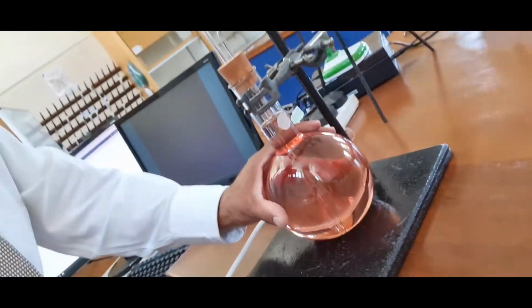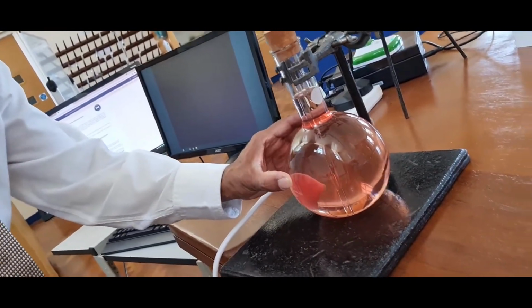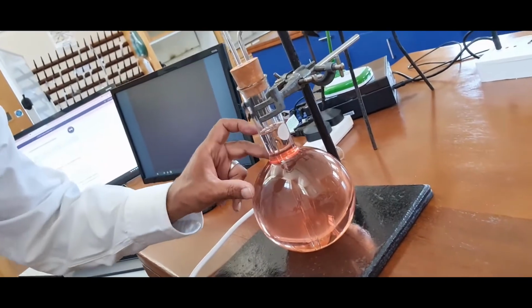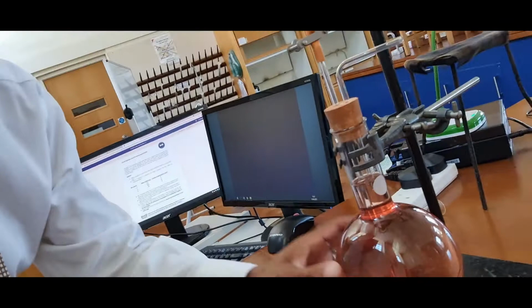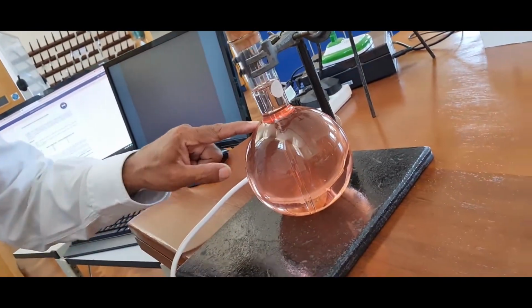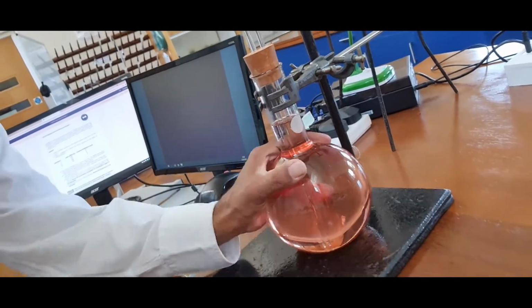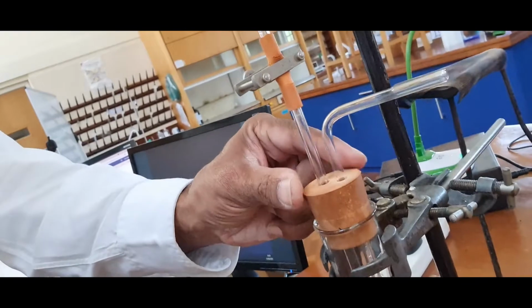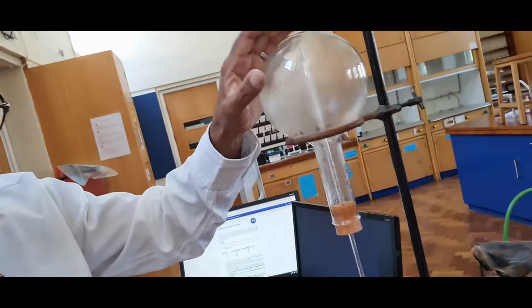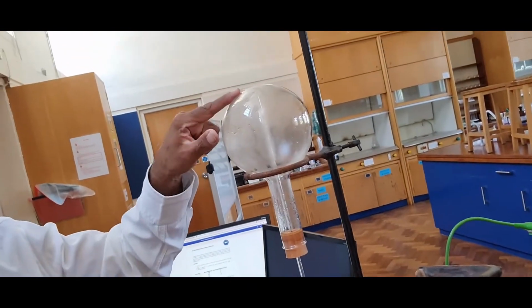This is water with a drop of sulfuric acid and a few drops of, no, actually, not phenolphthalein indicator, universal indicator. Universal indicator with a drop of sulfuric acid makes that bottom flask red. The bottom flask is attached to the top flask, and the top flask is full of ammonia gas.